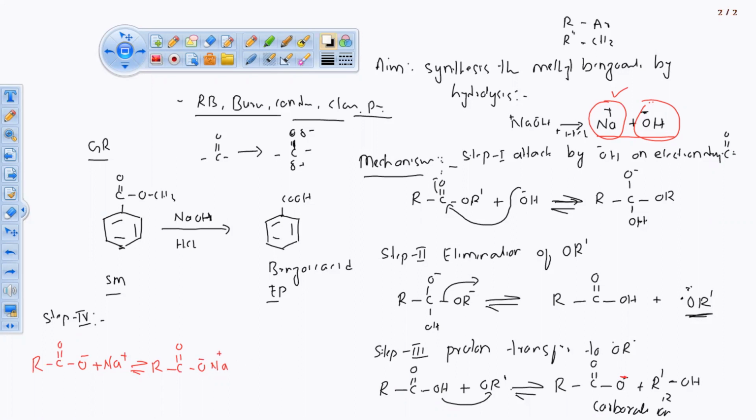Okay. Now down the arrow mark we have written hydrochloric acid. When this is formed, to the filtrate that remains we are going to add the hydrochloric acid.